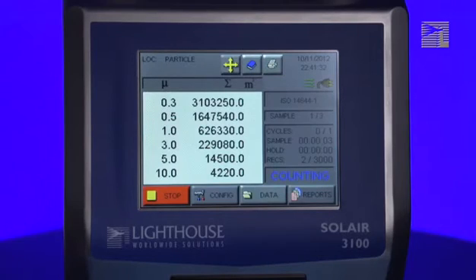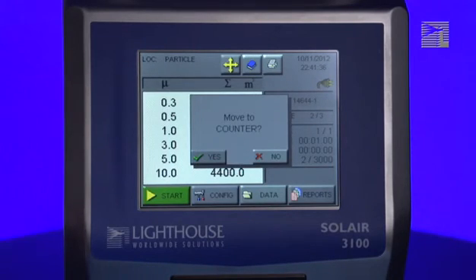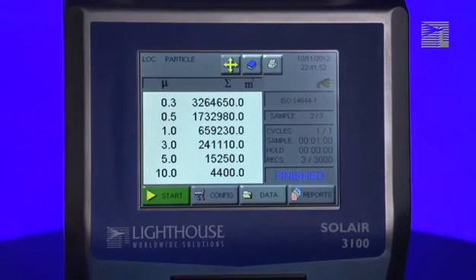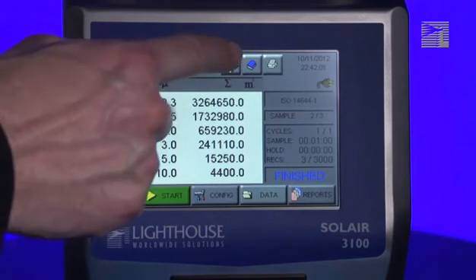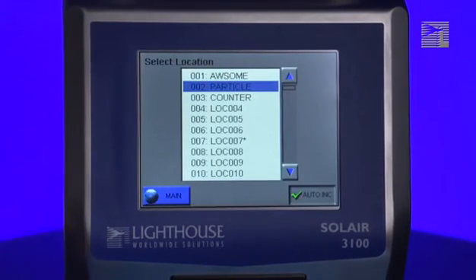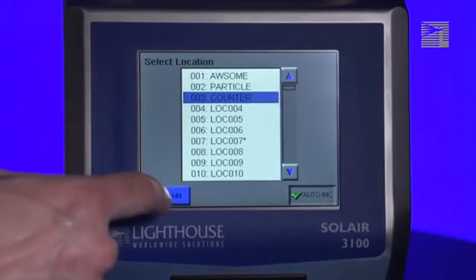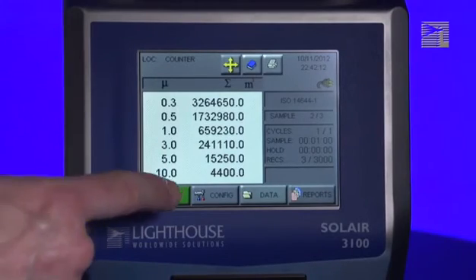Once the instrument has completed the sample, it will again prompt you asking if you want to move to the next location in the list. If you wish to take the next sample at a different location than the one it's prompting you for, press the No button. You must then manually select the next location by pressing the Locations button — the button with four yellow arrows pointing in different directions at the top center of the screen. Select the next location you want to sample and press the Main button to return to the main screen. Move to the selected location and when ready, press the Start button.